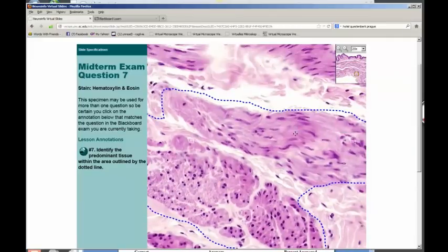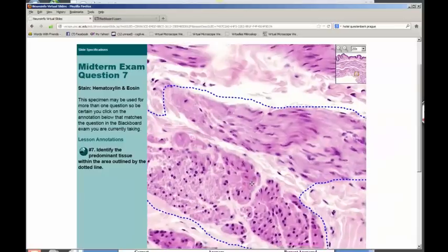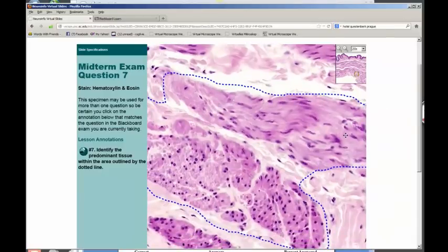because in smooth muscle cells, as you see in the longitudinal section, you have elongated nuclei, but the nucleus does not go the whole length of the cell. So you're going to have some cross-sectional profiles of smooth muscle cytoplasm with no nuclei. But when you catch it in the middle of the cell, you will see the nucleus. So this is the pattern of smooth muscle tissue. That's what you should have typed in.